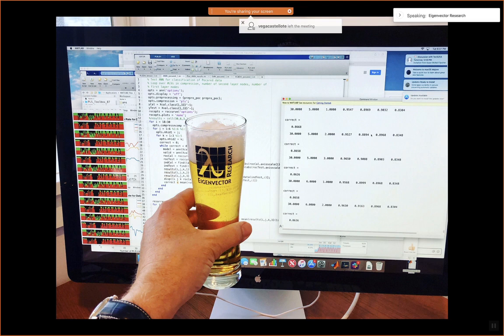Depending on how you do that, that might be more sensible for the problem you're looking at. And if you wanted to change the actual colors from red, green, blue, you can do that too. It's a setting in the plot controls, and I'll look that up here, and I'll post it in the chat.